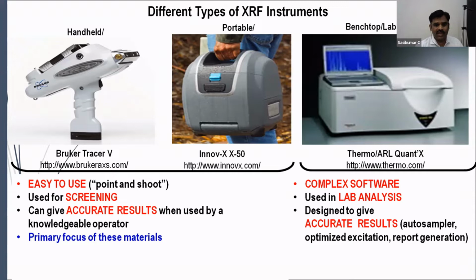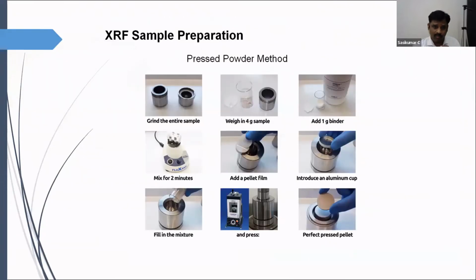And if you want to go for really high accuracy, then you need to go for a desktop model or any other version. Already Dr. Ajita has covered XRF sample preparation. So there are typical methods. Basically, there is a procedure for how to prepare your specimen.